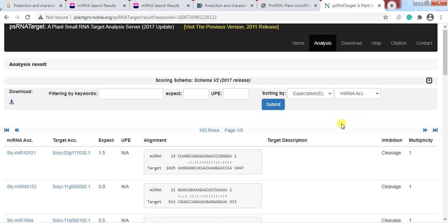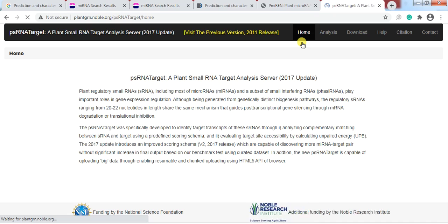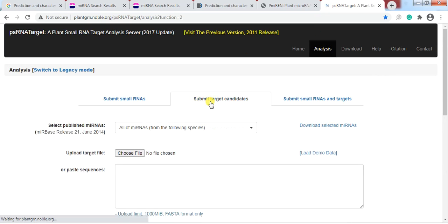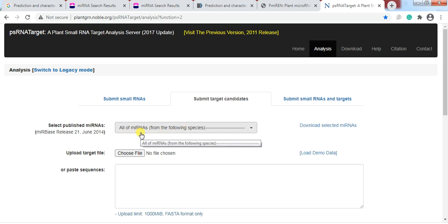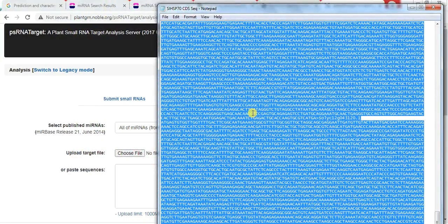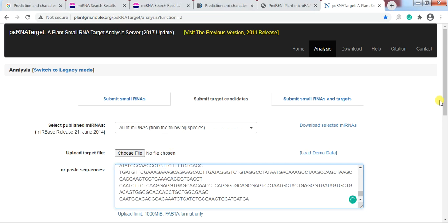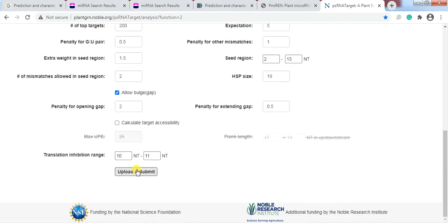If you don't have the microRNA sequence for your organism, you can also use the 'Submit Target' option. Here, collect all microRNAs that have been discovered across all species and check whether they are also present in your gene sequences. Collect all the microRNA sequences, copy them, and paste them here.